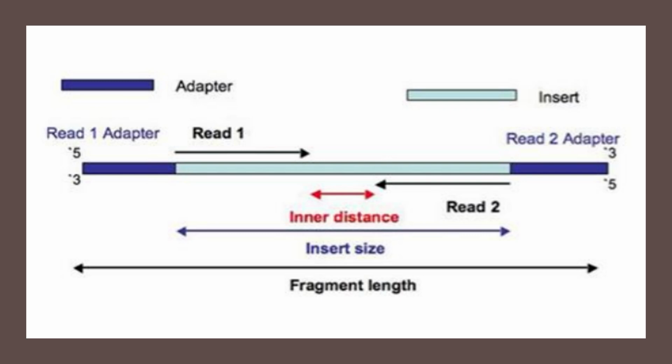On the other hand, some inserts are short, less than 300 base pairs. In this case, the paired reads will overlap and there will be no inner distance. The shorter the insert, the more overlap between the paired reads.